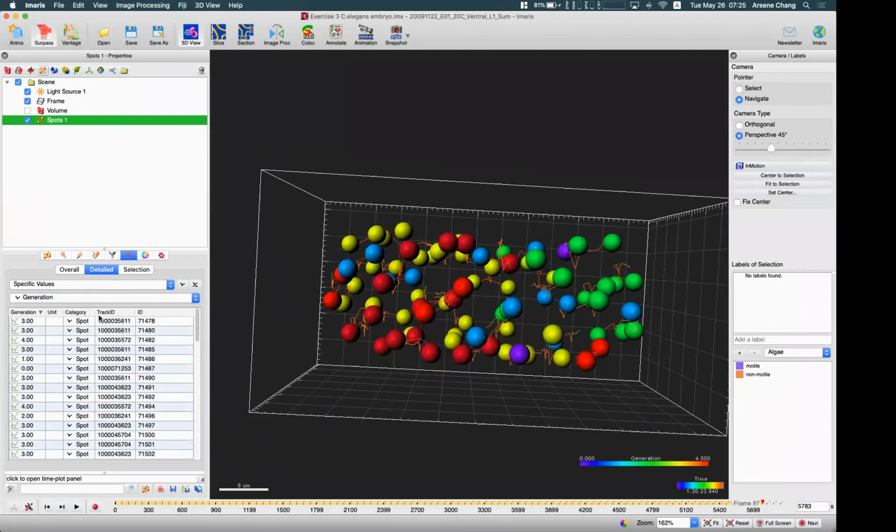Okay, and like I mentioned in the previous week, if this statistic is changed along with the time, then we will have this graph next to the statistic. If you click this arrow to expand the graph here, you will have the preview of this change along with time.